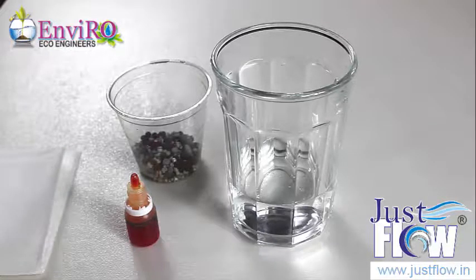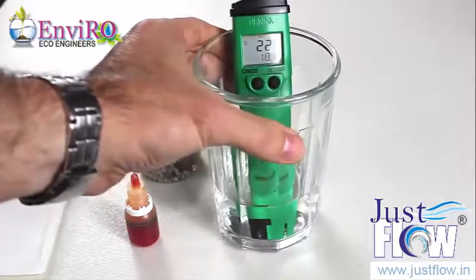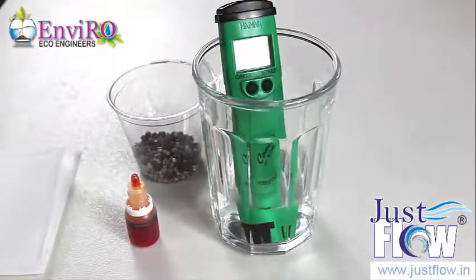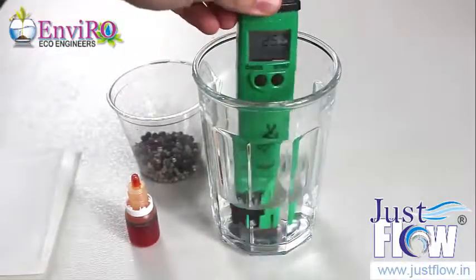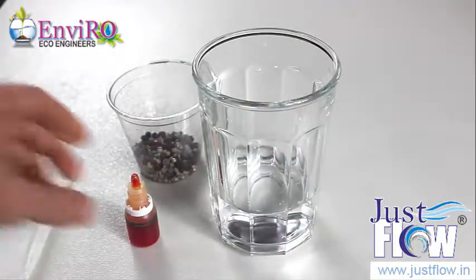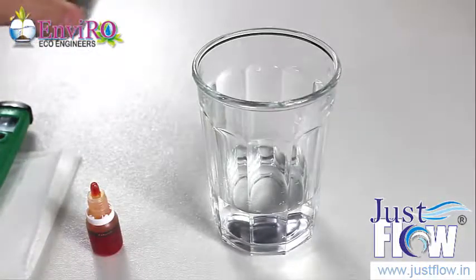But first thing we're going to check is actually ORP. This is just a pH ORP meter. We're going to take a quick check to see where we're starting at with that. It's right around, say, 250 or so on the positive side. ORP is pretty finicky. It can vary a whole lot, particularly out of your tap. Bottled, usually a bit more consistent, and today it's not too bad. Plus 250 is a lot better than what it could be.